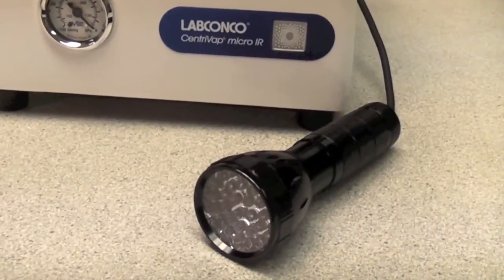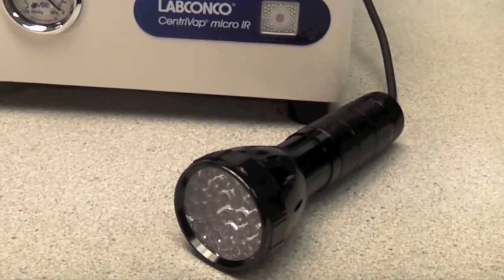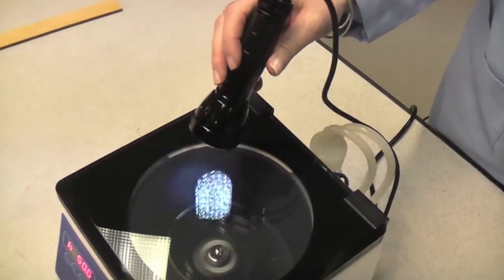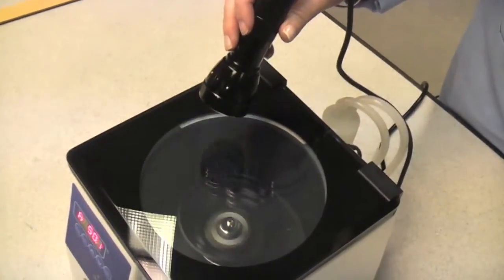The CentriVap strobe light shines light into the chamber to easily view samples while the rotor is spinning. The samples appear to be standing still. Since there is no need to stop the run to check on sample progress, evaporation time can be reduced by 20 percent.